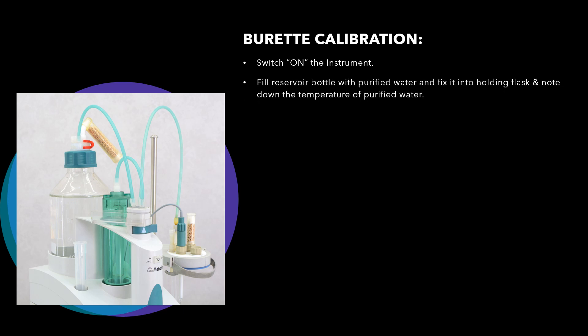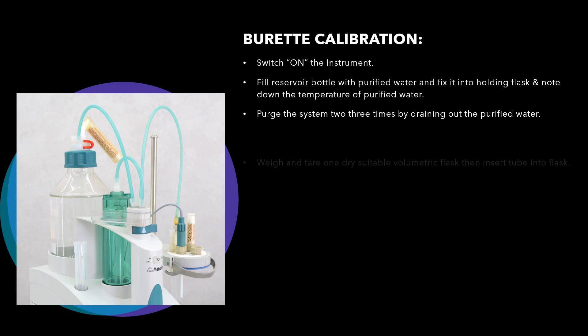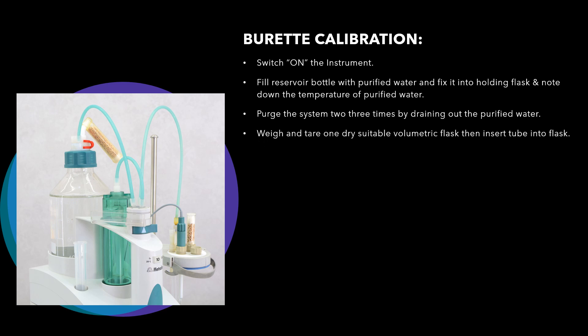Then fill the reservoir bottle with purified water and fix it into the holding flask, and note down the temperature of the purified water. To record the temperature you need a calibrated thermometer. With the help of that thermometer, take the temperature of the purified water. Then purge the system two to three times by draining out the purified water so that there are no air bubbles in the line.